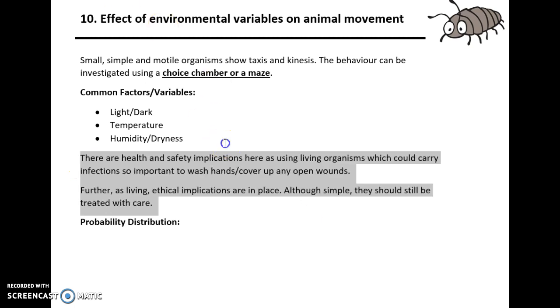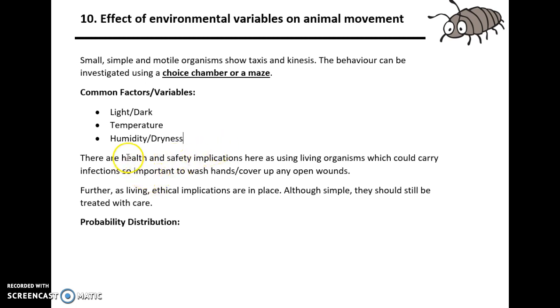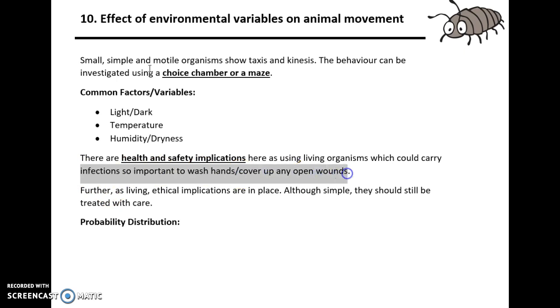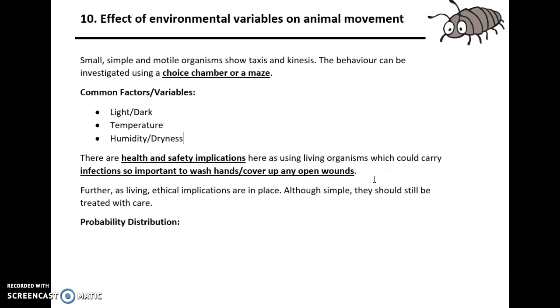Whenever we handle small, motile organisms like these, even though they are simple, we need to make sure that health and safety implications are in place. They could carry infections, so questions may be asked in this context. Because we're using living organisms, we need to think about health and safety: we have to wash our hands, wash any surfaces down with ethanol after use, and cover up any open wounds.